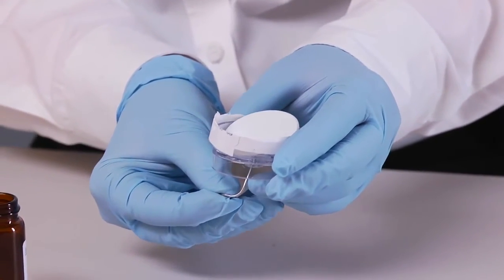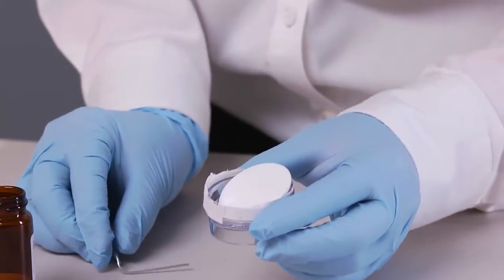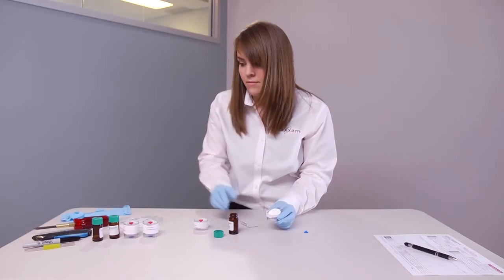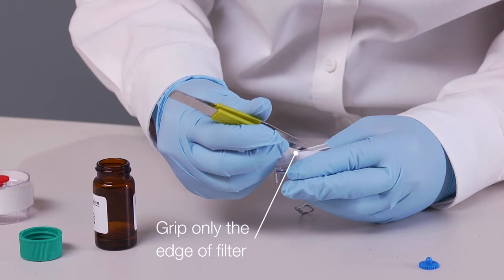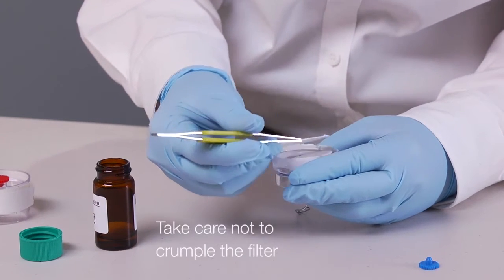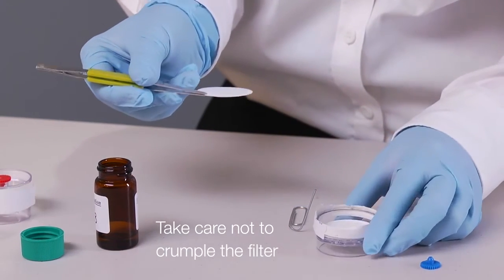When the edge of the support pad is above the cassette rim, use the tweezers to peel the filter from the pad. Grip only the edge of the filter to avoid disturbing the sample surface. Also, take care not to crumple the filter.